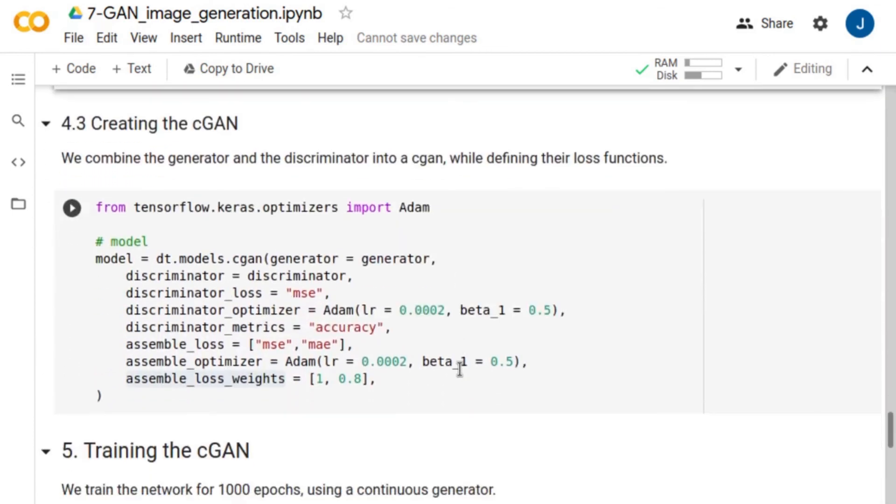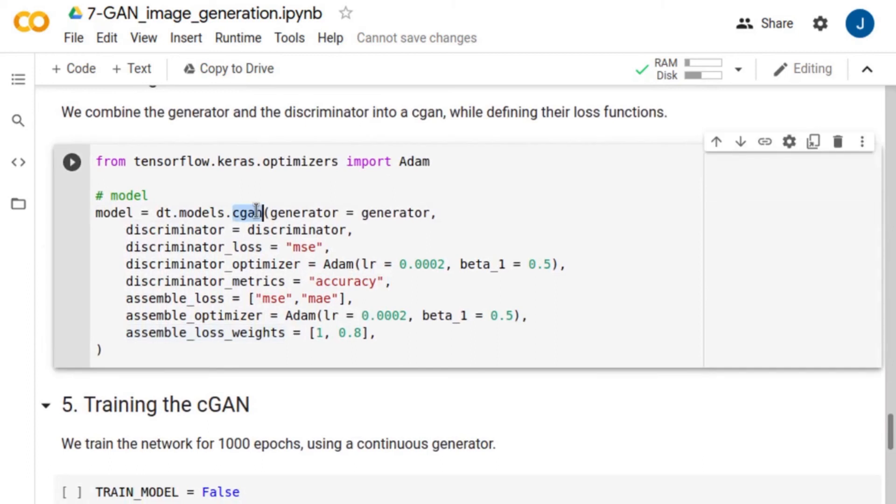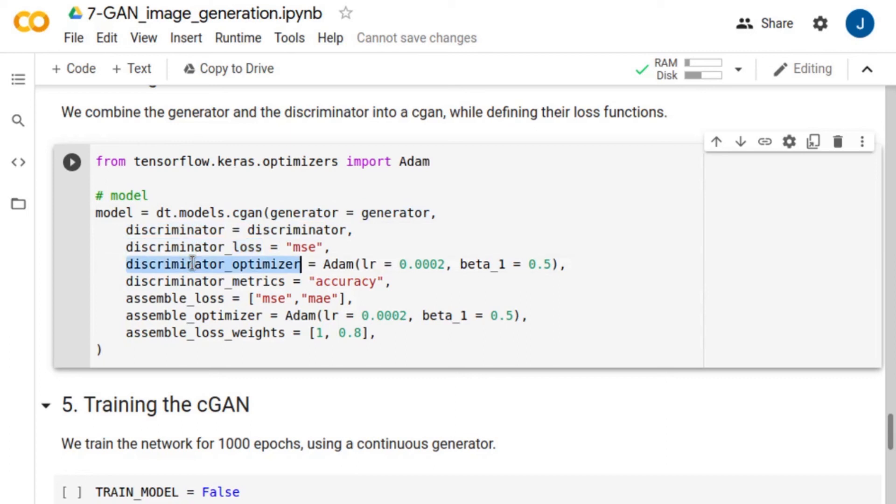Next, we create the GAN from these two networks, the generator and the discriminator. Also, we define the loss functions as well as the optimizers for both the discriminator and the assembled model.